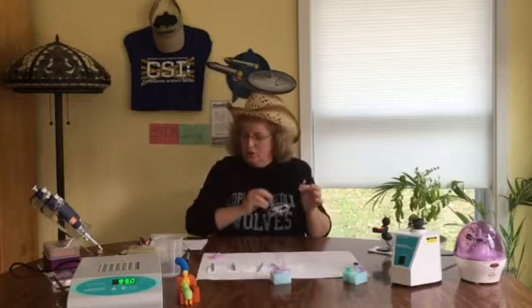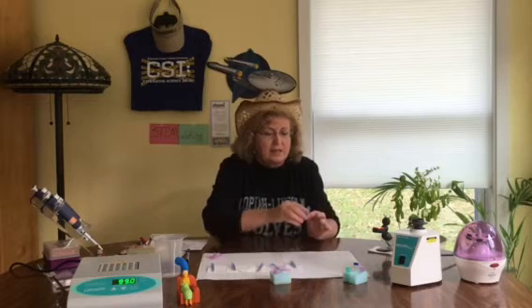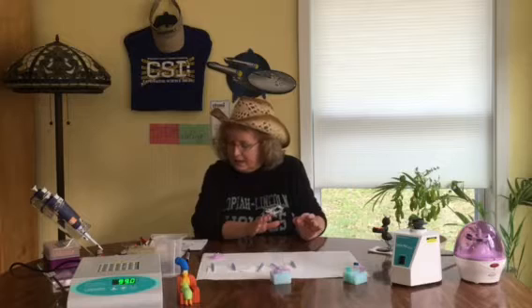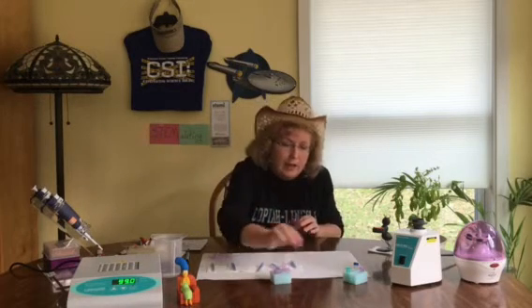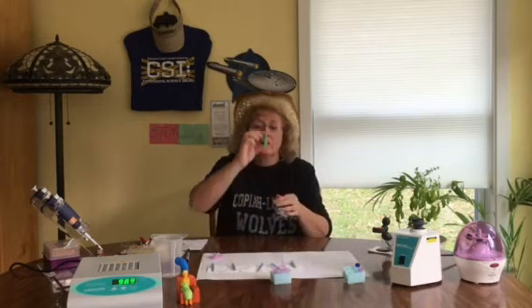After you've finished macerating the insect, breaking up the exoskeleton as much as possible, it says to add Instagene immediately. Now don't have an anxiety attack. Everything's going to be okay. You can get your Instagene, and remember, very important, shake it like a Polaroid picture. You may be too young to even know what a Polaroid picture is. I'm not sure. So shake it, and then how much do you need?